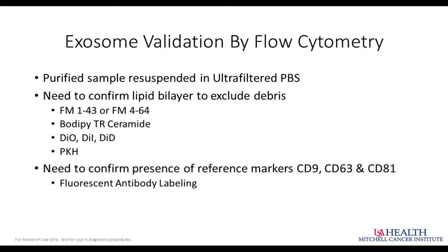The key point of trying to develop a no-wash staining protocol is that every wash takes at least 2.5 hours. By the time the ultracentrifuge comes up to speed, you spin for 2 hours and you spin it down. There's no such thing as a quick wash when you deal with exosomes. So we've worked very hard on trying to develop our no-wash staining protocol.